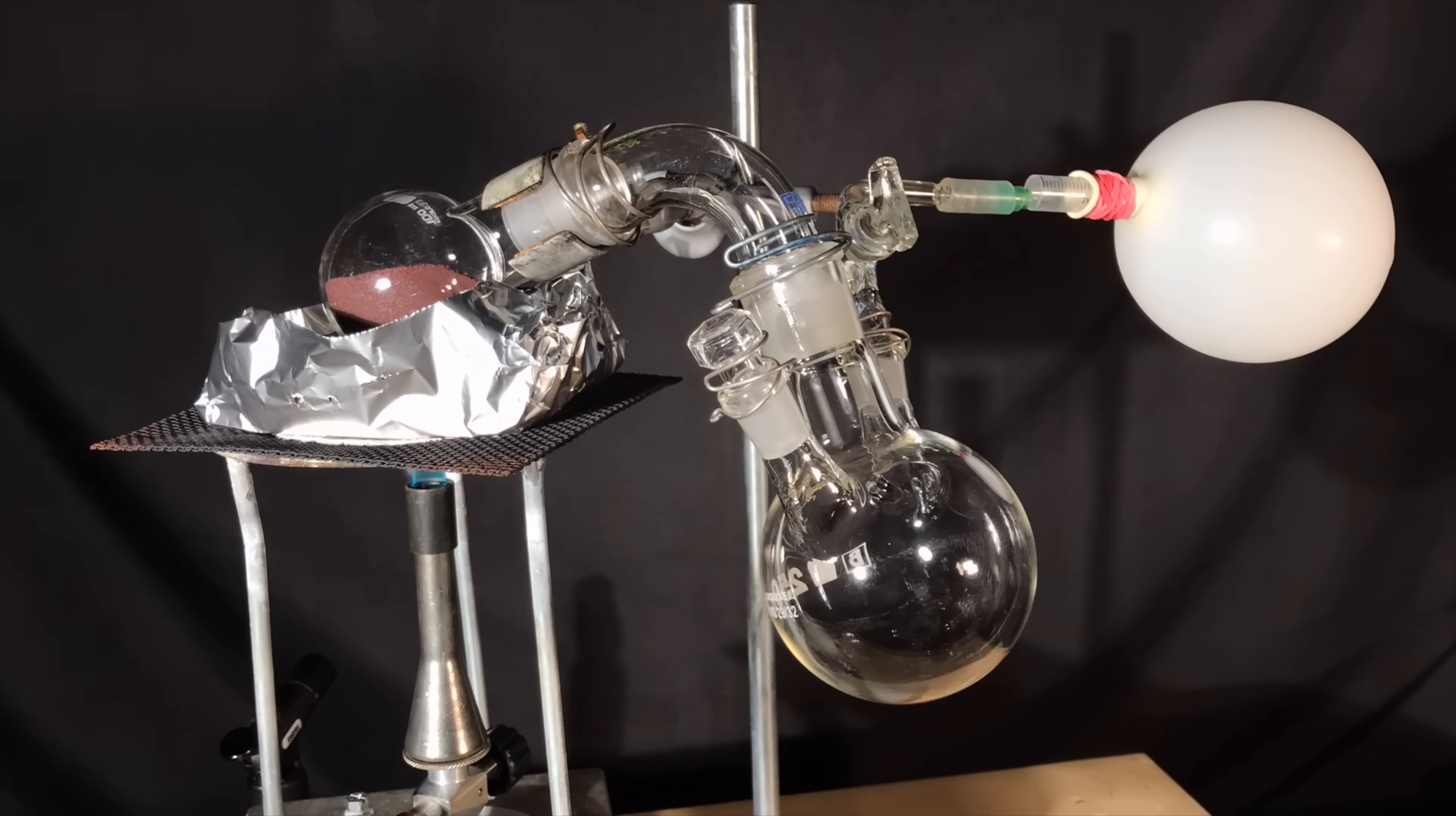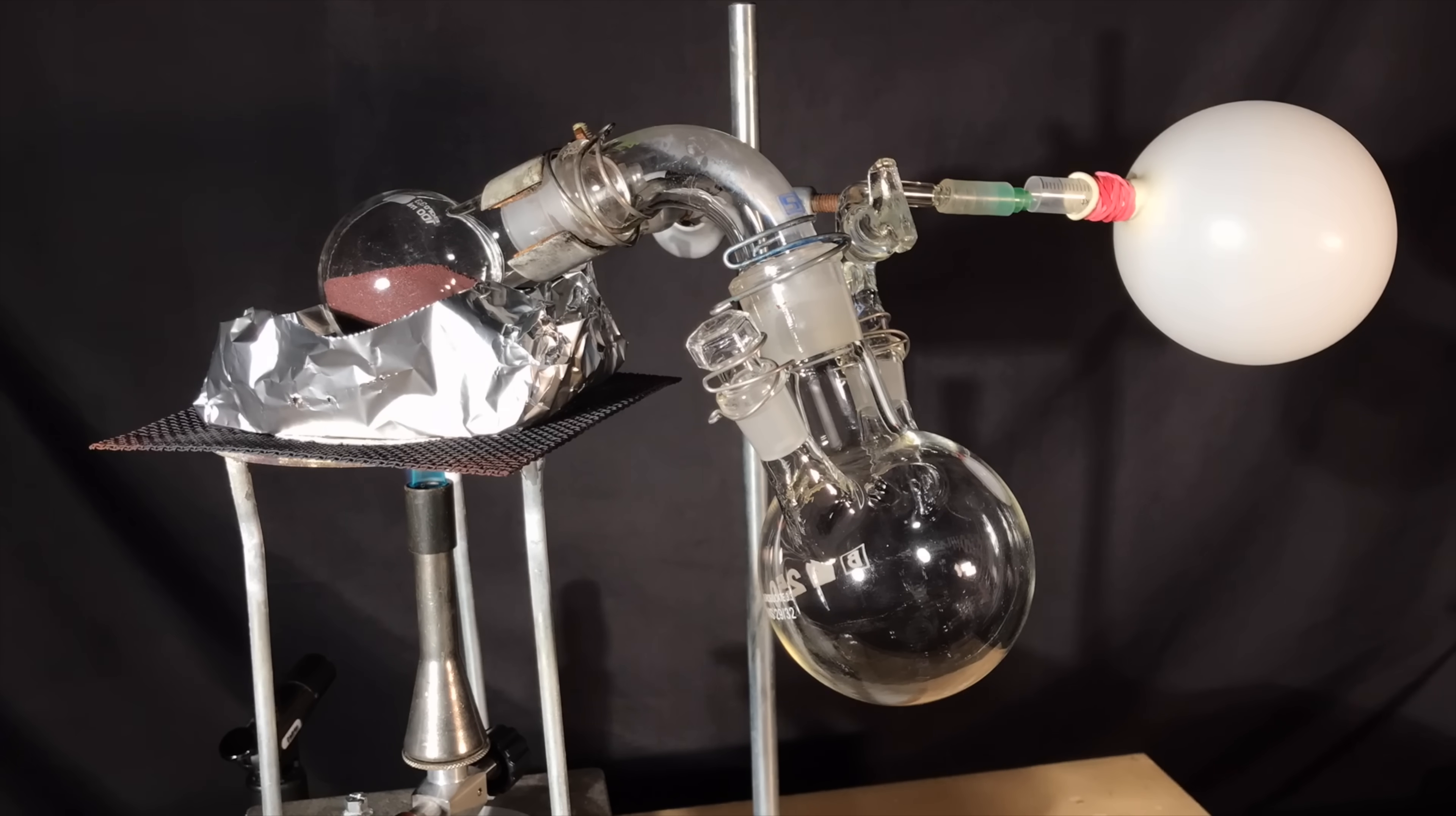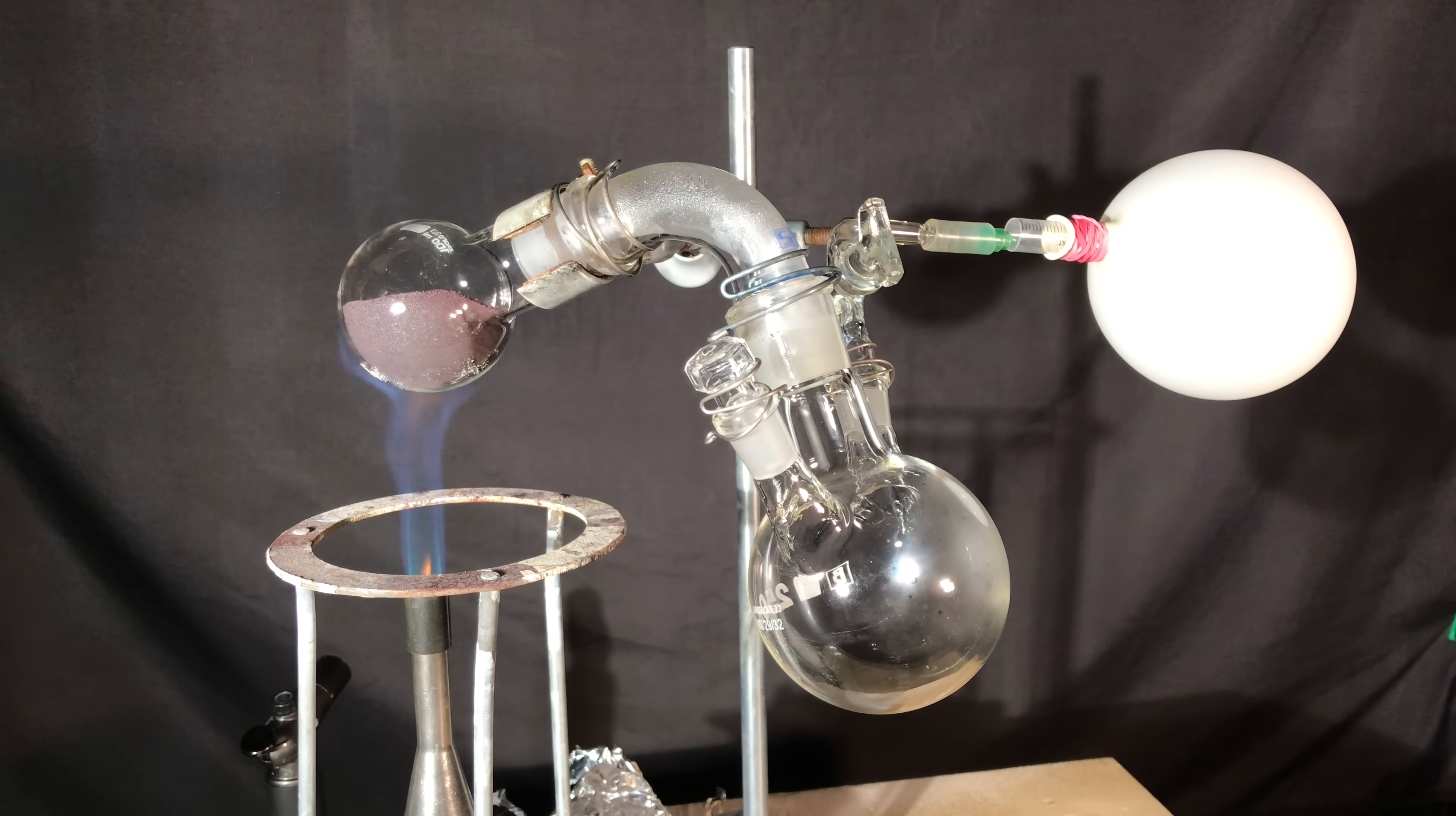To ensure pressure equalization without air entering the apparatus, the stop valve connected to the argon balloon must be opened before starting the heating process. It would be possible not to flush with argon beforehand, but phosphorus will react with air and it might become dangerous. It would also lower the yield, so we decided to use argon instead.